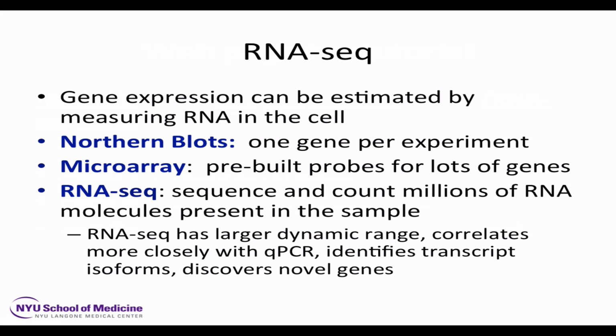You're not counting the entire set of RNA, but you're hopefully counting a representative population of molecules from the total RNA that you isolate from your target cells. So we call that the transcriptome.